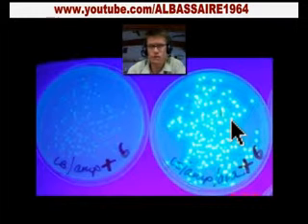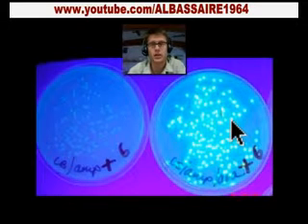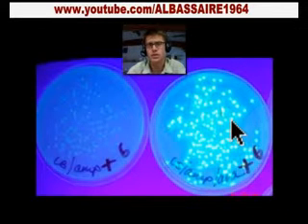You then add a transformation solution, then you add the plasmid, and then you just cross your fingers, because it usually doesn't work. But occasionally, some of the E. coli will pick up that plasmid, and we only need one of them to pick it up, because then we can grow them on a plate, we can have colonies, and then we're going to have a bunch of glowing protein. So that's the bacterial transformation. There's not much analysis as far as that goes. It's just a hope that we can get the bacteria to pick it up.